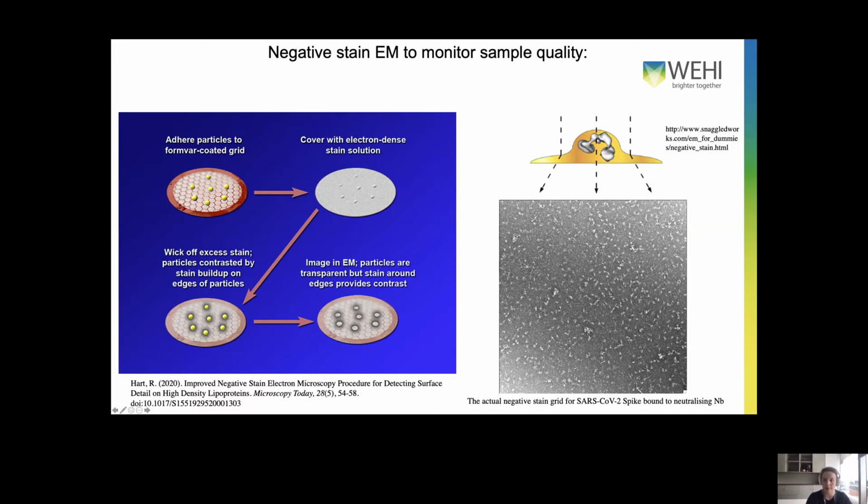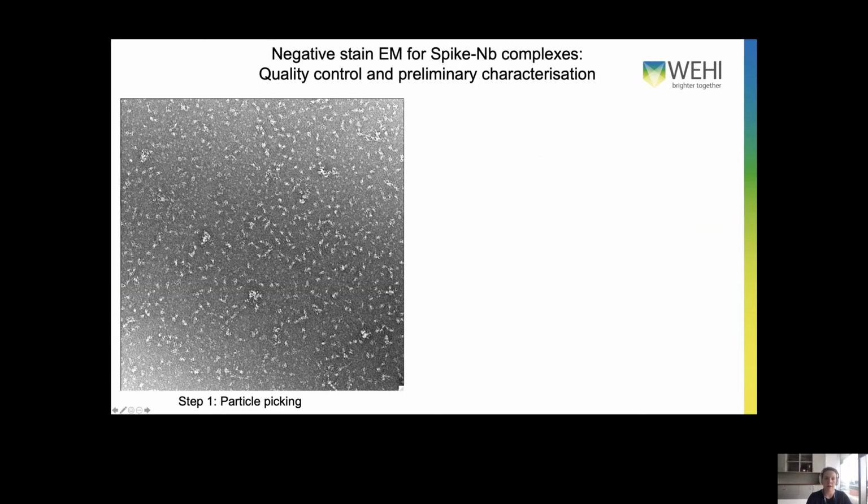So you can see darker color micrographs with the white particles throughout. And usually we use this to estimate again how good the sample is. What we're looking for is very little aggregation, which is actually what we see here as well. So the only aggregates are probably here and here. And it is a very homogeneous looking sample as well. Some heterogeneity you see is probably due to different orientations of the particles. So this is the micrograph we saw on the negative stain electron microscopy.